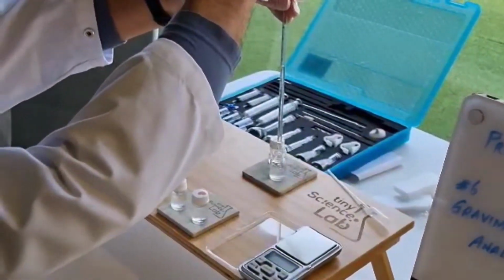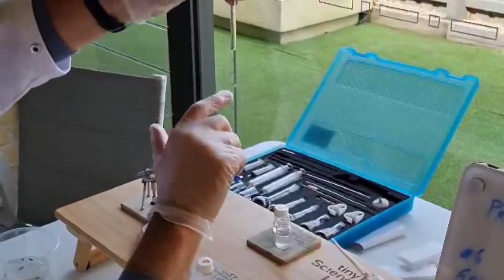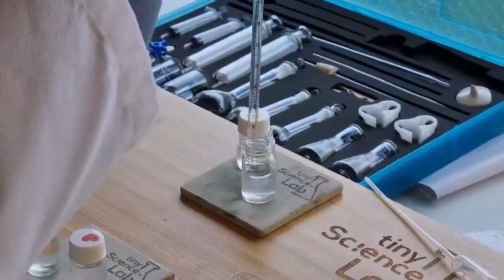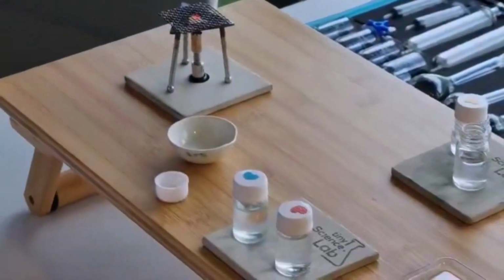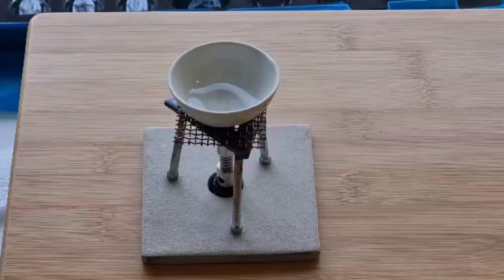So let's take an equivalent amount of each. One problem when using small quantities is they move very quickly. Make sure there's no bubbles in there. There's one. And we'll transfer it to the evaporating basin. And now we'll evaporate the water. So our goal with the evaporating basin is to evaporate the water and leave the salt behind.